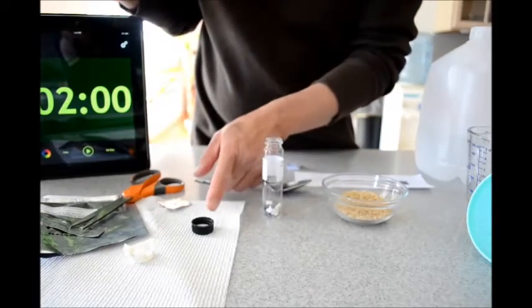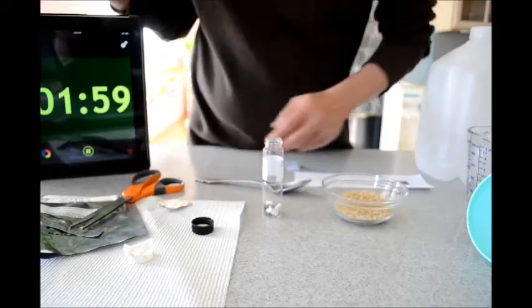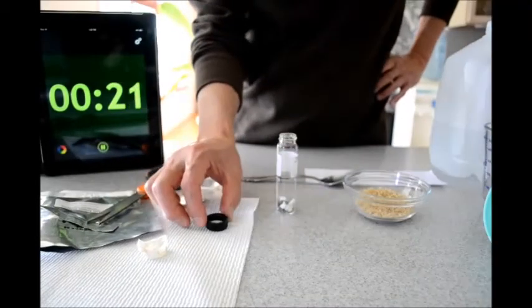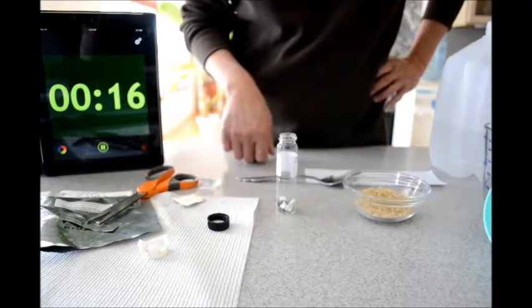Let's set a timer for two minutes for this to dry. We wait for the solution in the cap to dry at about two minutes.